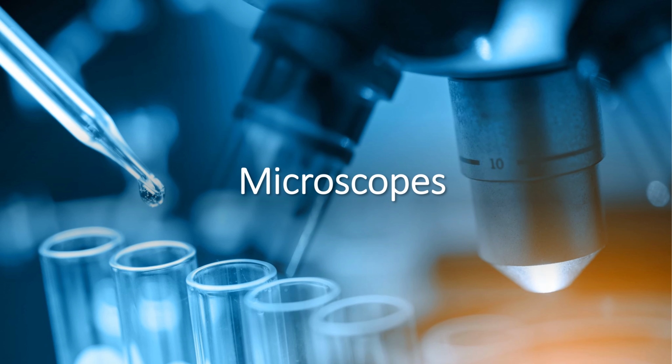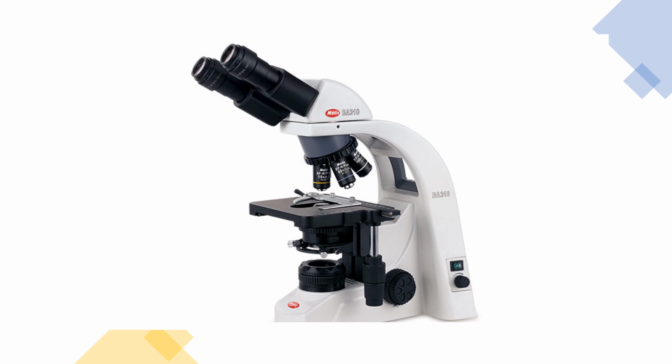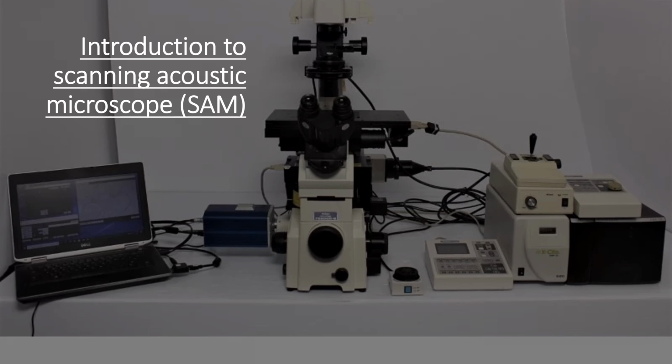Microscopes. Saying this word, the first thing that may come to your mind are lenses. That is, this microscope. But there is more to them. Microscopes can look like this too. This kind of microscope is called acoustic microscope or scanning acoustic microscope.